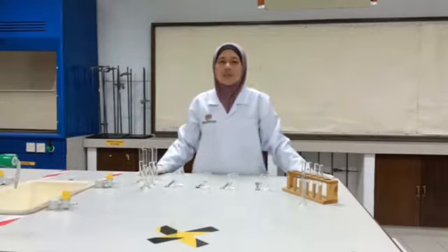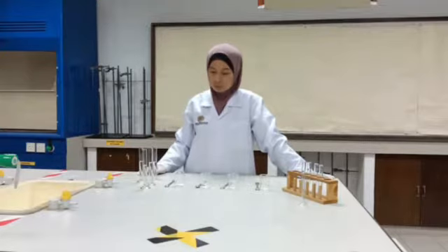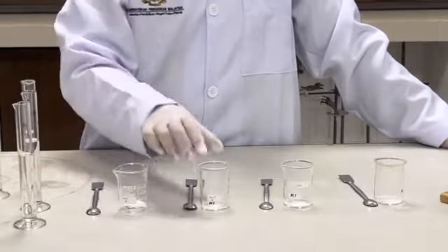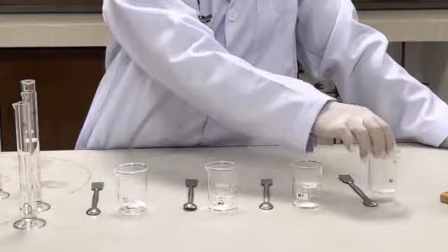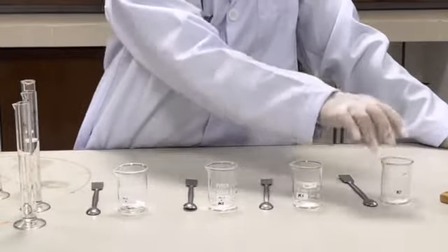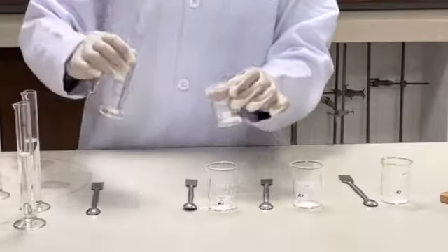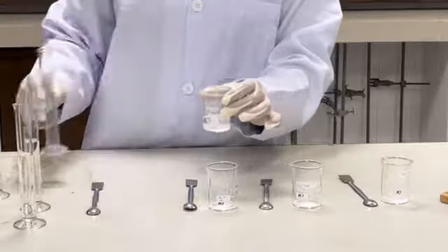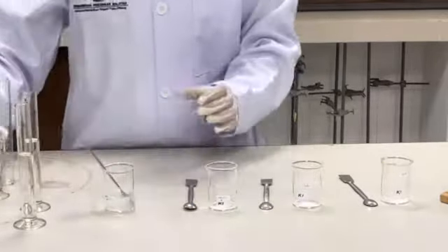To identify the anion present in an aqueous salt solution, first we need to prepare the aqueous solution of the salt. We have salt A, salt B, salt C, and salt D. First we need to dissolve salt A in 20 cm³ of water. We will do the same for salt B, salt C, and salt D.